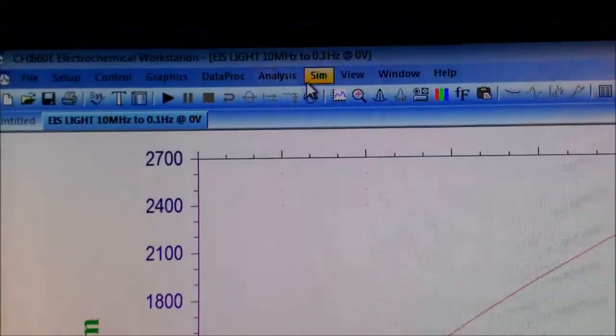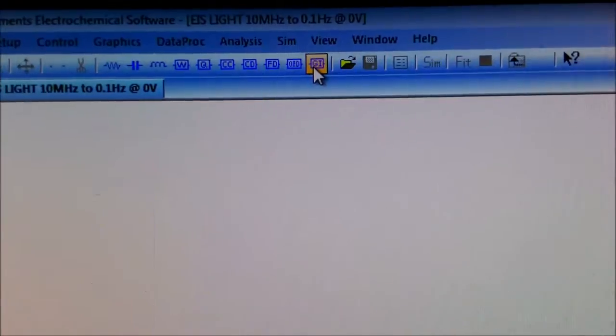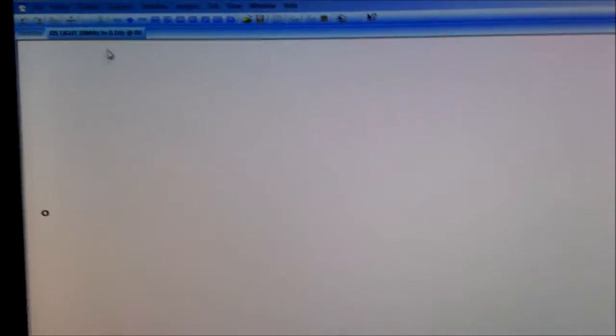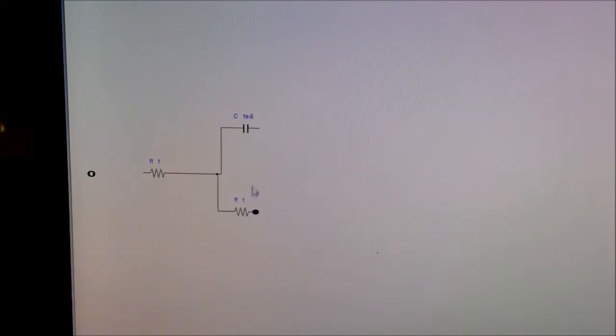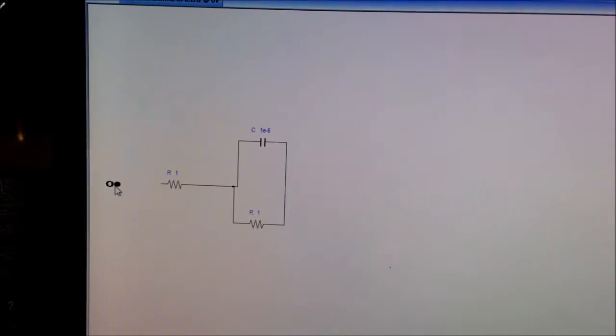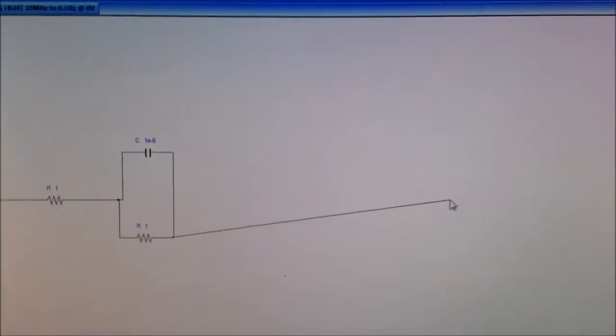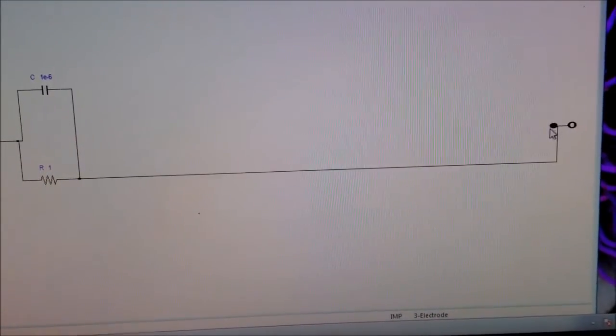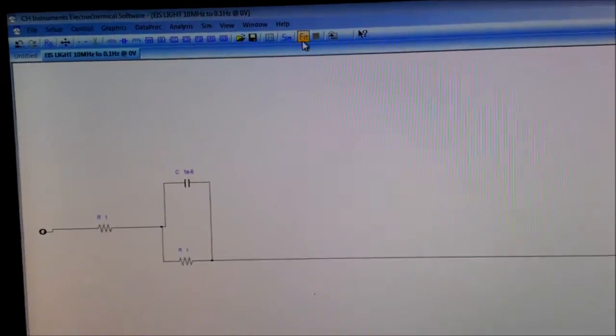For this you have to go to simulation, then go to mechanism. You can see the interface and you have to bring some circuit elements. Let's first bring one resistance, then one capacitance. I am going to fit this EIS plot into a Randles circuit, then another resistance, and let's connect it. Now you have to click fit.